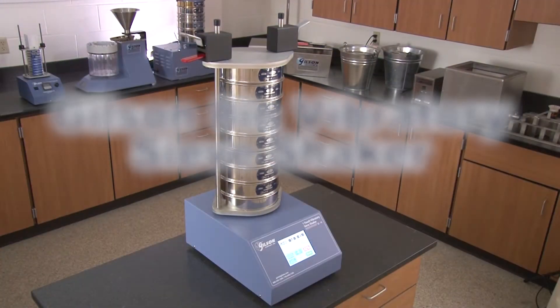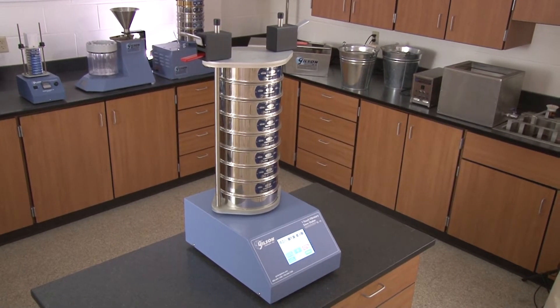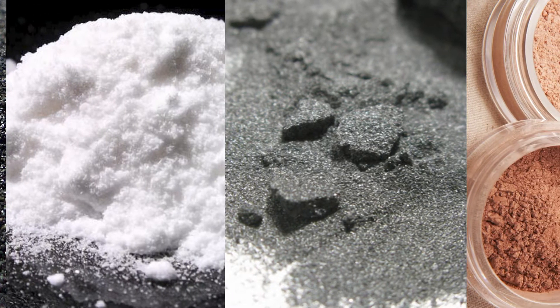The Gilson SS10 One-Touch Vibratory Sieve Shaker accepts 8-inch ASTM or 200-millimeter ISO test sieves, and is ideal for powders and many fine granular materials.